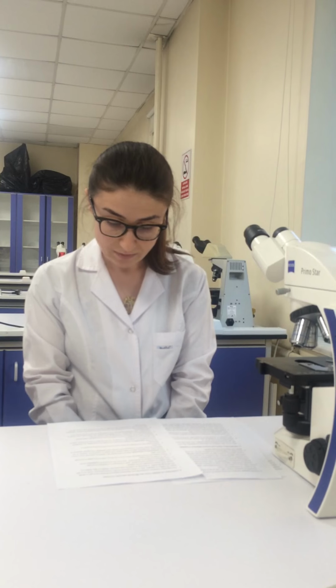Equal amounts of DMEM, about 10 milliliter, is added to stop the reaction with a gentle shaking of the tube, and then these tubes are centrifuged at 700 xg for 10 minutes. This supernatant is decanted again and 10 milliliter DMEM is added into each tube.